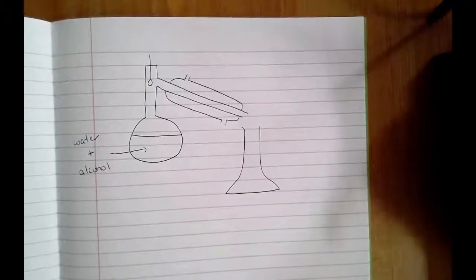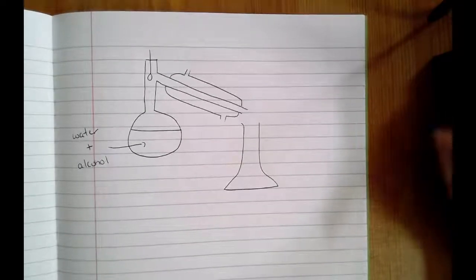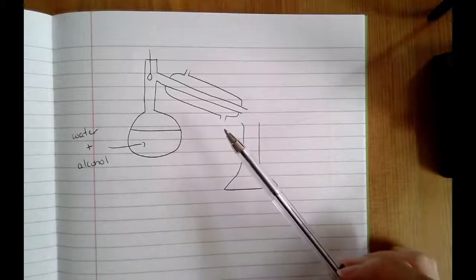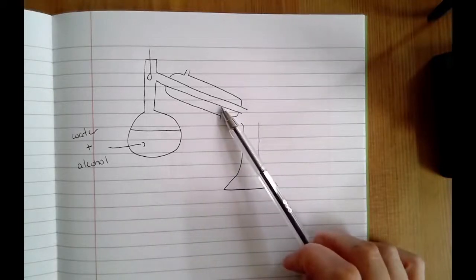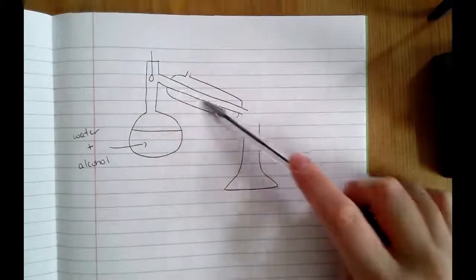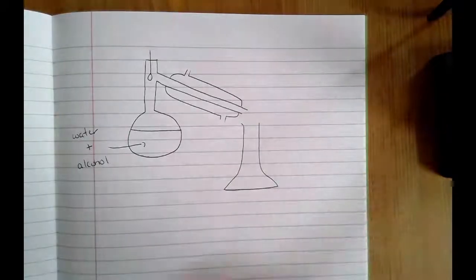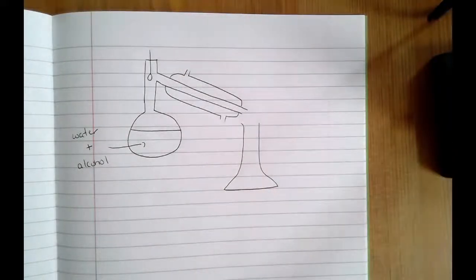Okay, so in that exam question, I mentioned that you could use distillation to separate two different liquids. So we're going to have a closer look at that now. So I've drawn out my distillation apparatus again. This is actually better than the one I drew a second ago. It should be at a slant. It shouldn't be perfectly horizontal. It should be at a bit of a slant. So this is my distillation apparatus again.